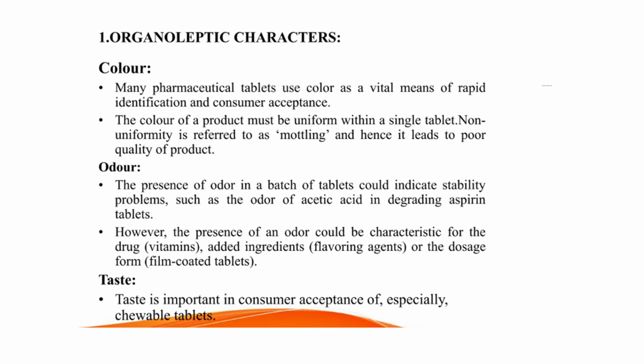Coming to the color, we know that tablets are available in a lot of different colors. The main purpose of coloring tablets is identification and consumer acceptance. At the time of coloring, we should keep in mind that the color on the product should be uniform.